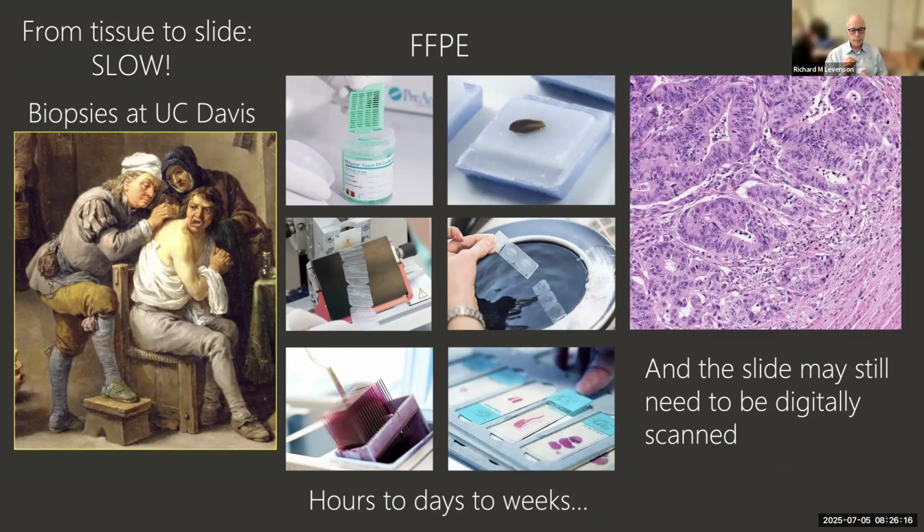After you remove the piece of tissue, there are lots of steps, which I will describe in more detail here, but I'll show you just in sort of a high-level form. The tissue has to first go, typically, into a formaldehyde to actually preserve it. Then it has to get embedded in wax so that it can be cut. And we need these thin slices because you can't look at a thick piece of tissue with van Leeuwenhoek's microscope.